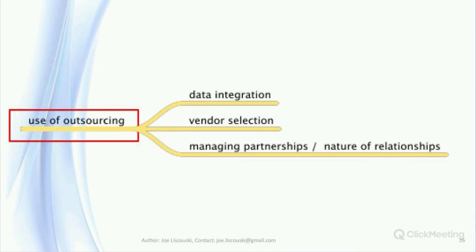Outsourcing is often used to expand the lab's capabilities, both for specialized testing that's needed on an occasional basis or to handle overflow work. A lab automation engineer's role in outsourcing is to help ensure that the results of the work can be used within the laboratory systems. What form, for example, will the returned results take? Are those results in that format compatible with your laboratory systems? Can it be automatically entered, or does it have to be reformatted to work well? Do they have good control over their systems, including backup and archiving? Again, it's a matter of qualifying your vendors, and it's something that an LAE would be expected to help with.